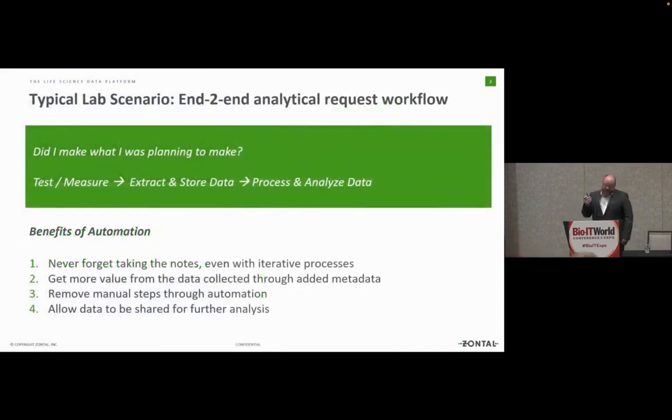So my dear end-to-end analytical request workflow that everybody would like to have is, well, for a chemist, should answer the question, did I really make what I planned to make in my little reaction tube? And this workflow can be very automated, very easily, if you have the right tools. And the benefits of such an automation are very clear. We're reducing human error.